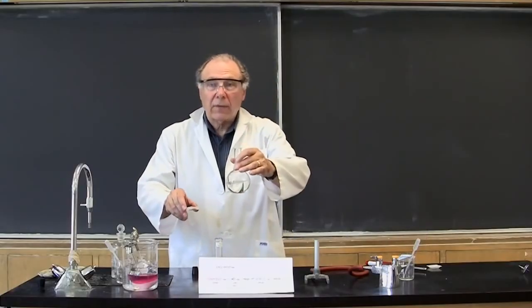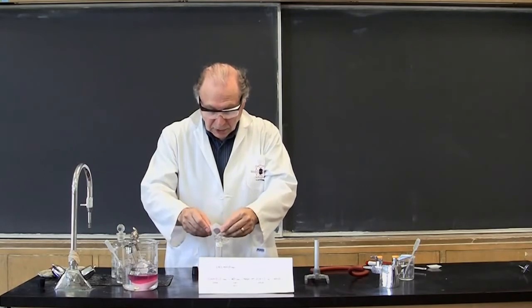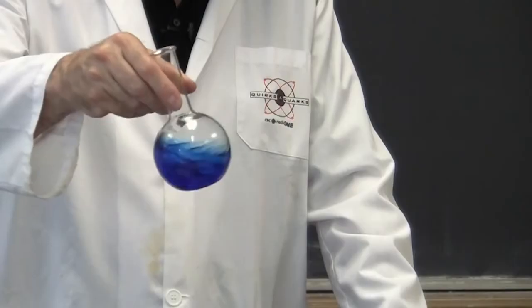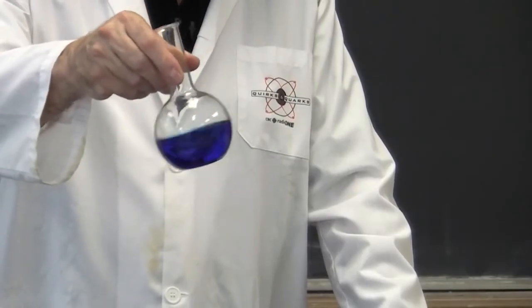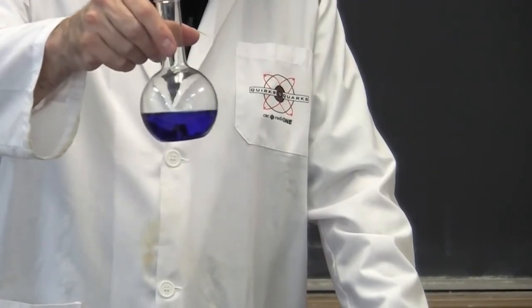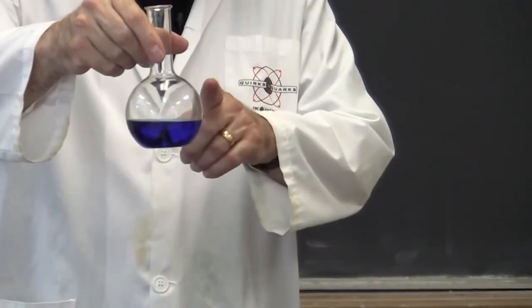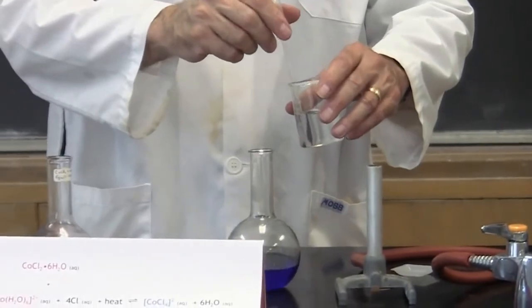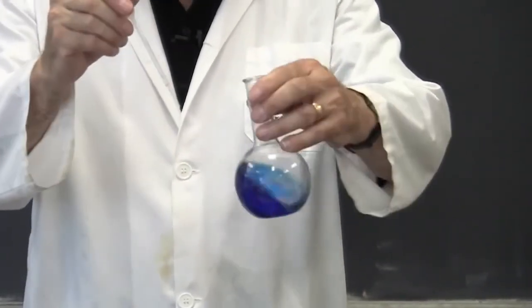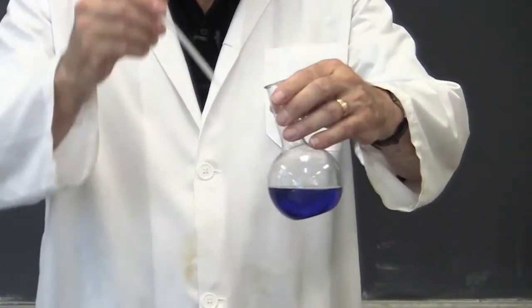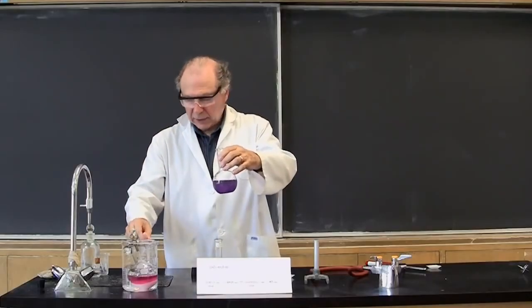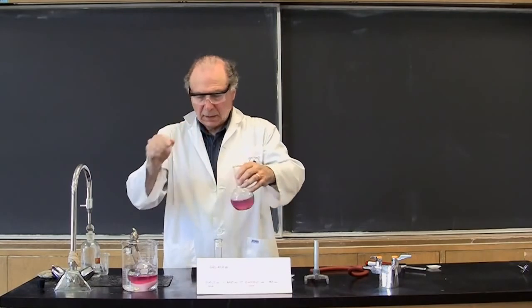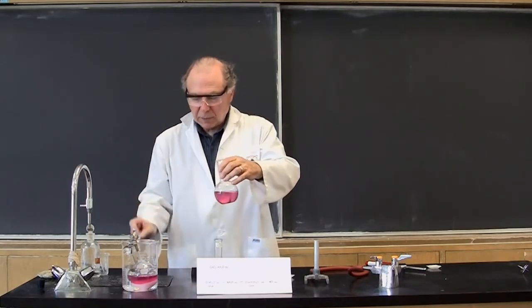Here I have 95% alcohol and I'm going to put the solid cobalt chloride in here — you can see how quickly it dissolves, and not only that, look at the beautiful deep blue color that is formed. This deep blue color is often referred to as cobalt blue when you see it in vases. Adding some water, you can see the shift occurring now to the pink, and this is how we solve the problem in the first case.